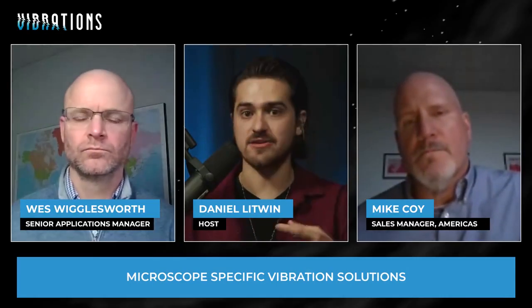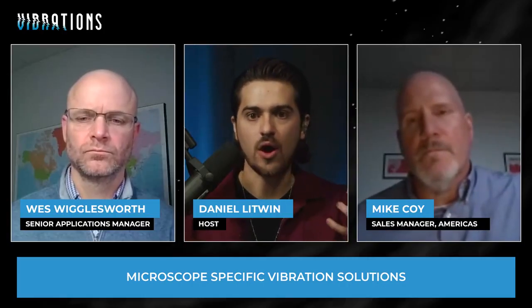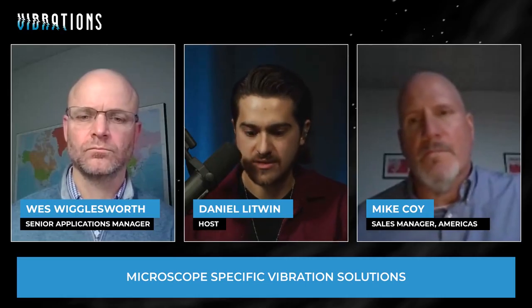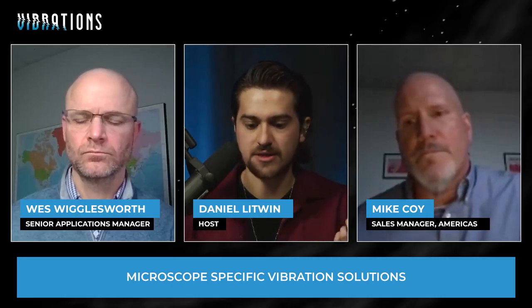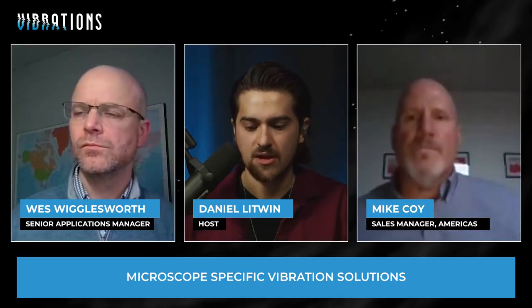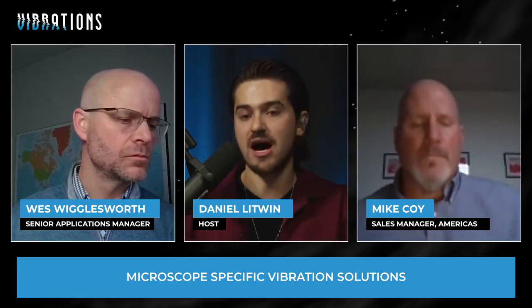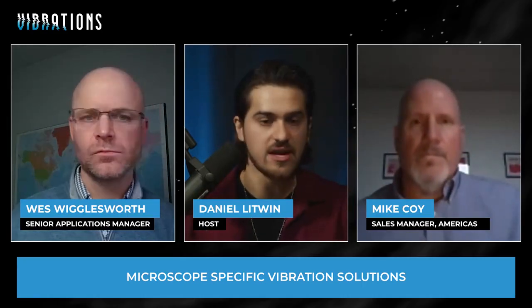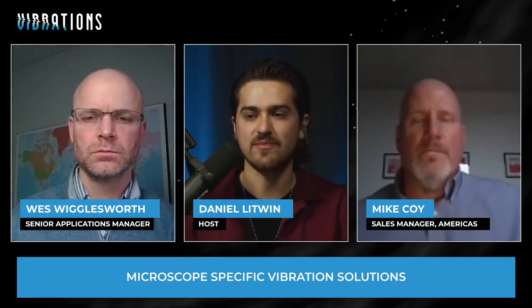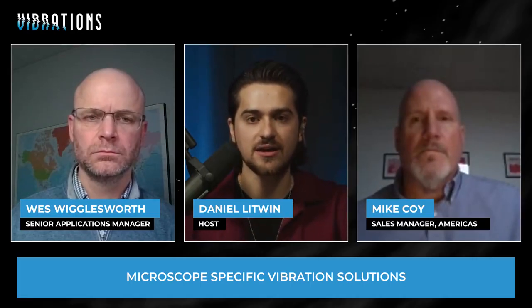And in that entire timeline, there's a necessity to determine what the VC curves are, what the realities in my environment are that are going to determine vibration control and mitigation. So how long before I take delivery of my microscope should I consider addressing any vibration issues? When should that process start, alongside, parallel to, or in conjunction with choosing a microscope?